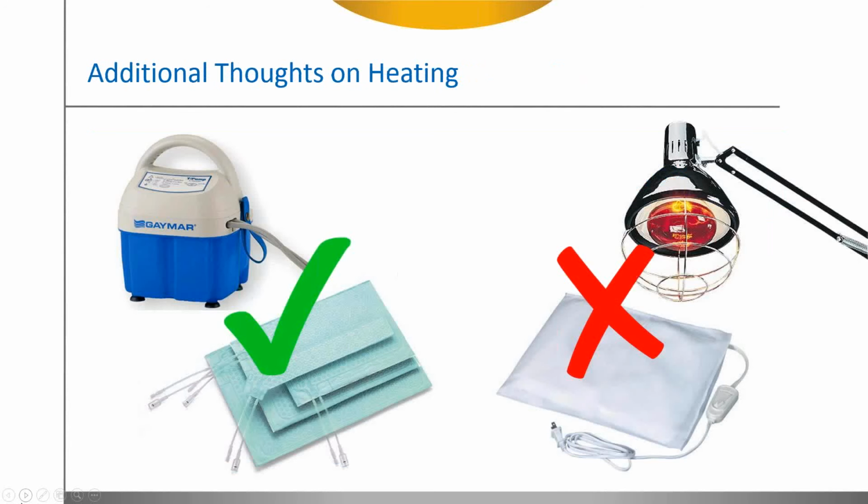So moving along here. One additional thought about the heating. Some labs don't use integrated solutions like the monitor I showed you before. So there are other body temperature maintenance options. Heating pads: please refrain from using equipment which is not designed for surgery.